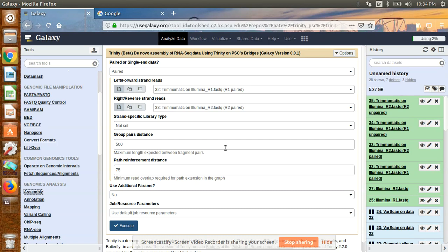What is a contig? We know that reads are small in size. In the case of paired-end sequencing, we have done Illumina 2x150 base pair sequencing, so reads are small. When we assemble them using de novo assembly, all the overlapping sequences assemble together and make larger-size contigs. So a contig is the assembled form of reads. We can get many contigs, and after that we can further process them — for example, we can BLAST those contigs using BLAST2GO software.